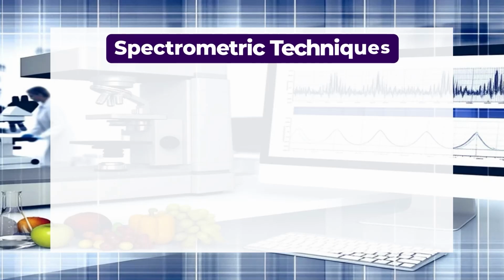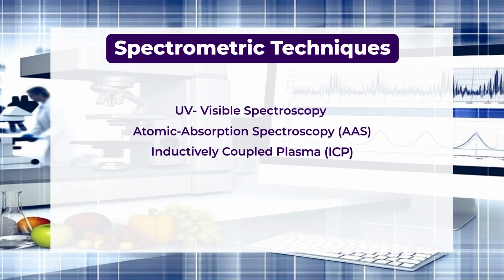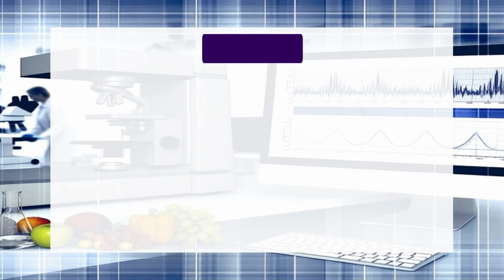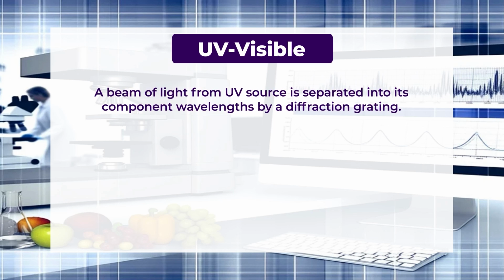What are the spectrometric techniques? The first is UV visible, then atomic absorption spectroscopy, inductively coupled plasma, Fourier transform infrared spectroscopy, and nuclear magnetic resonance spectroscopy. In UV visible, we have a beam of light from a UV source. We have seen in the electromagnetic spectrum that there are radiations of various wavelengths.